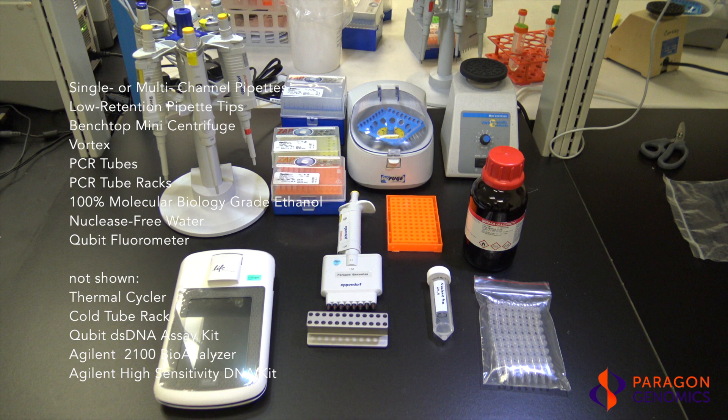You will also need nuclease-free water, a cold tube rack, a Qubit fluorometer and dsDNA high-sensitivity assay kit, and an Agilent Bioanalyzer and high-sensitivity DNA kit.